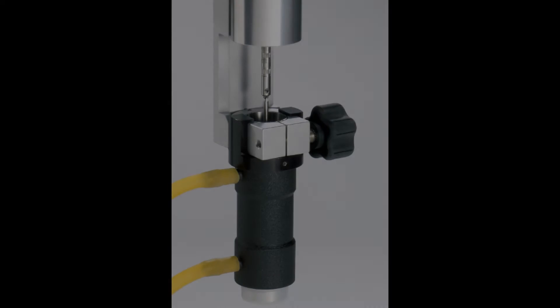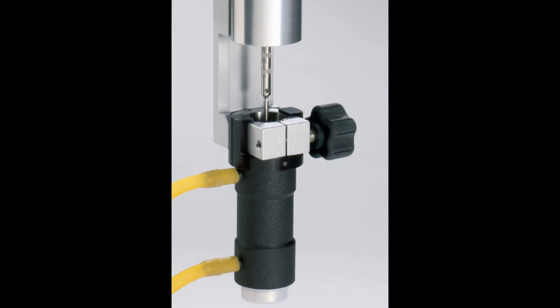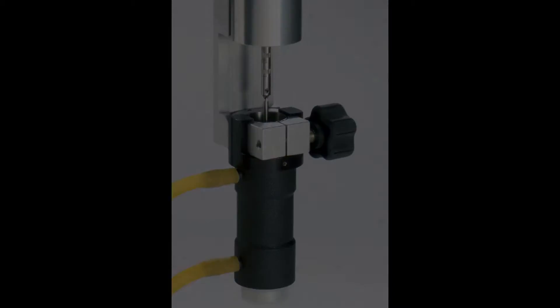Our enhanced UL adapter is an accessory that increases the lower end of your instrument's measuring range. It will allow you to measure very low viscosity materials that cannot be measured using the standard disk spindles.